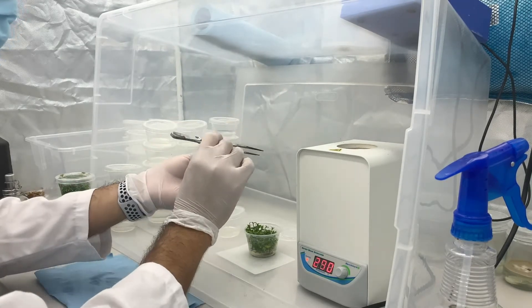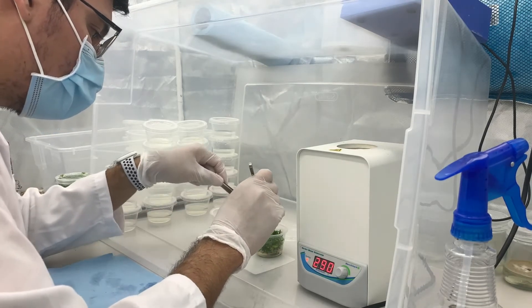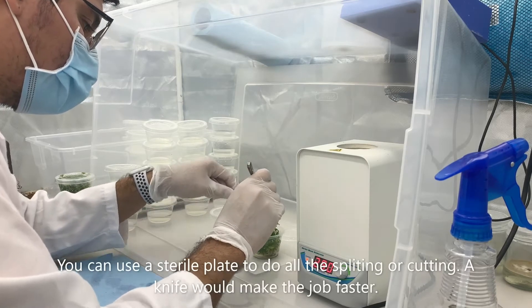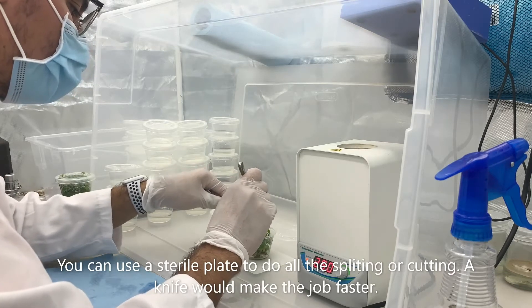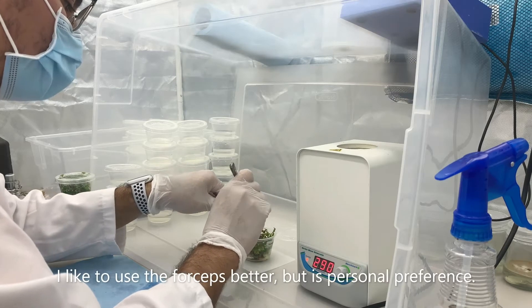We will be splitting enough plants for the next five containers, but this is totally up to you, depending on how big your plant is and how many cultures you would like to propagate. You can always use a sterile plate and a sterile cutting knife to make this job a little faster. We just prefer forceps — just a personal preference.